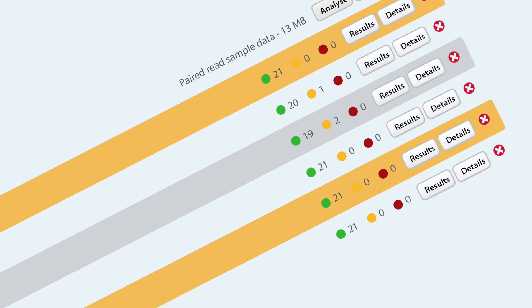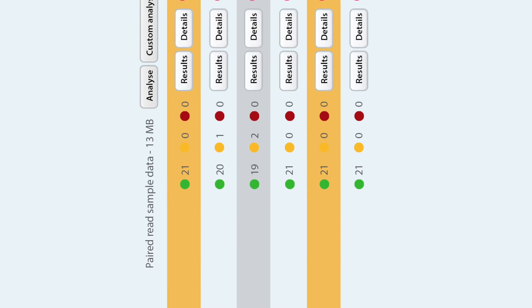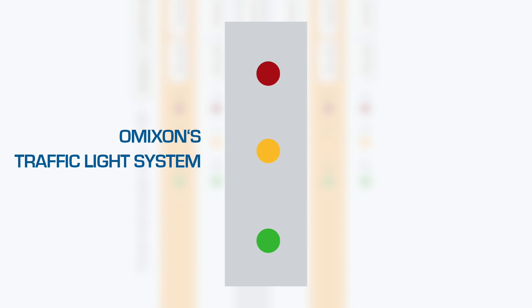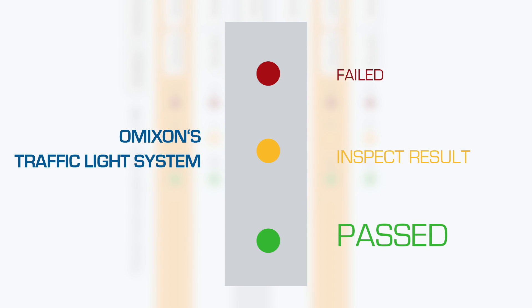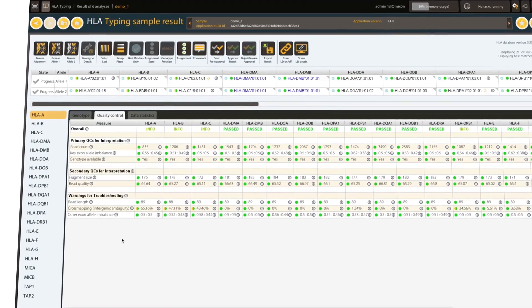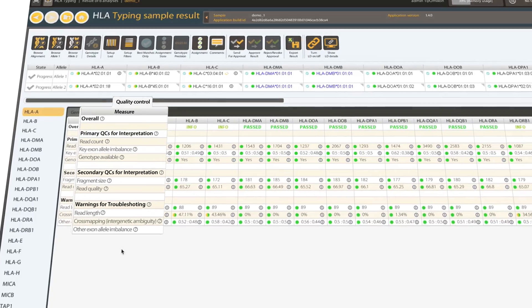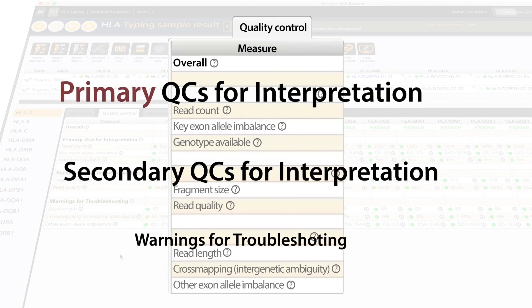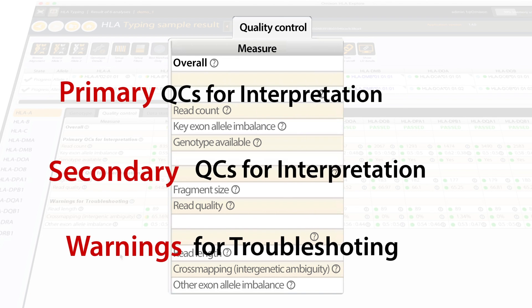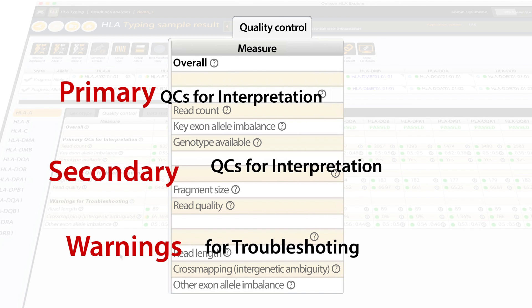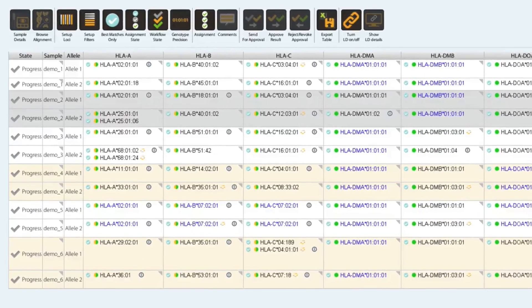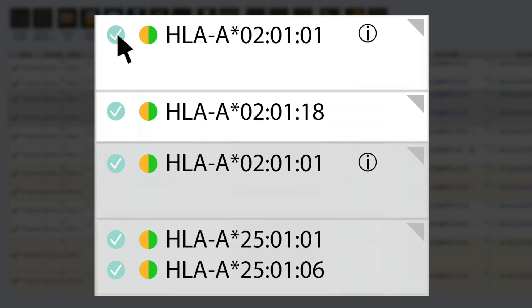When the analysis has completed, Omixon's unique traffic light system helps to guide you to the samples that require your attention. The traffic light system summarises information about the different QC metrics to help you assign the best genotyping match. HLA-Explore has different QC metrics to give you the highest confidence in your results. Although HLA-Explore is a research-focused software, it still supports a clinical approval workflow.